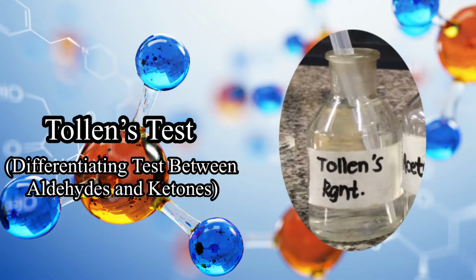The next test is the Tollens test. This is used to differentiate between aldehydes and ketones. The test is based on oxidation reaction. Between aldehydes and ketones, only aldehydes can be oxidized and thus will be the only one to give the positive result. The positive result is the formation of a gray precipitate or a silver mirror, which is due to the conversion of the reagent into silver metal.